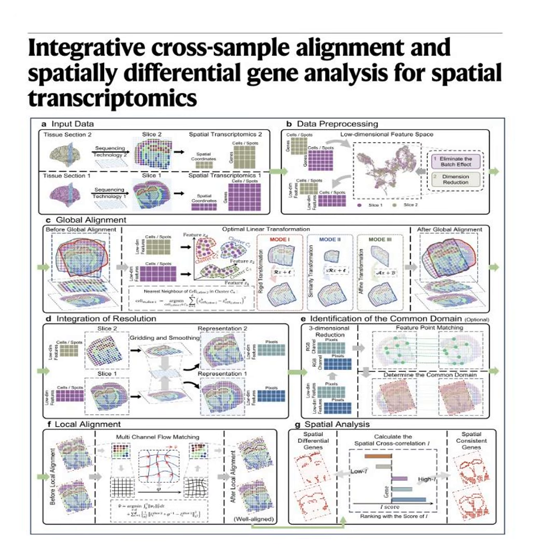When you stack 2D slices without perfect alignment, the biological structures look jagged and disconnected, like a poorly stacked deck of cards. Got it. With CODA, layers of a brain cortex form continuous, properly stratified sheets in 3D. Which brings us to my absolute favorite example in this entire deep dive, the axolotl.